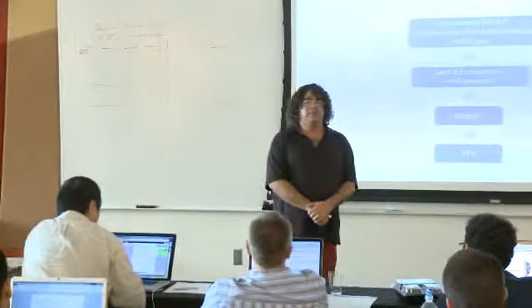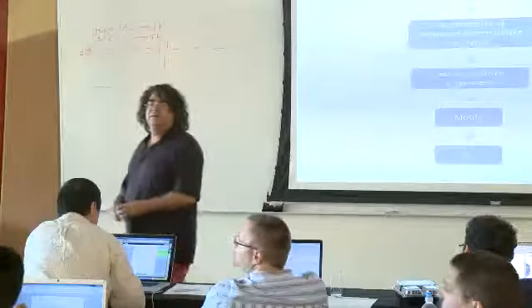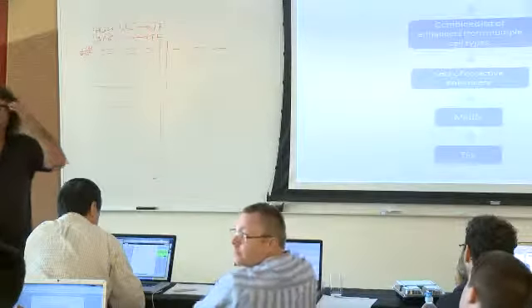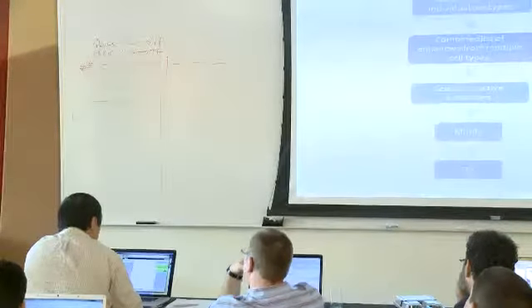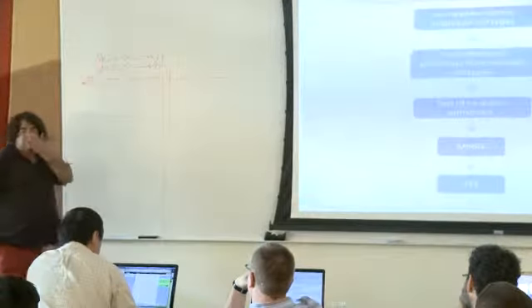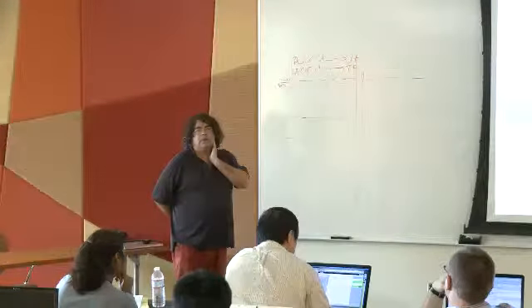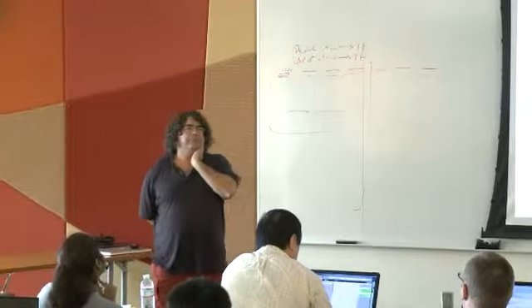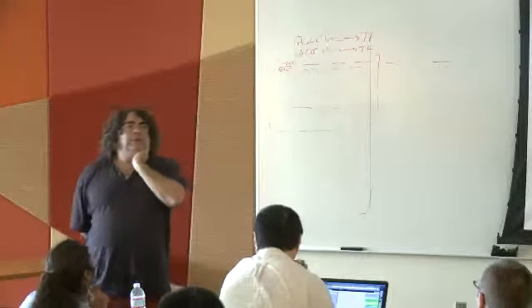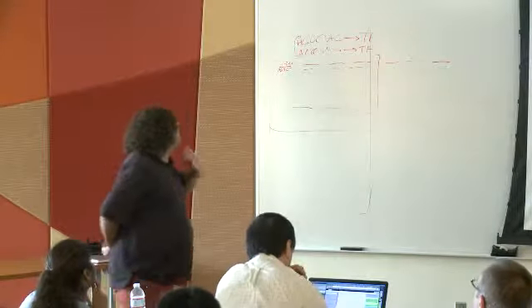Sure. Any more questions? Yes? To identify a motif reliably, how much coverage do you need at that region? Because there is background noise as well, right, when you compare. So you need like 30x, 20x, that's enough to... Oh, we're not doing... Because you're aligning the reads, right? We're aligning the reads to this region, right?